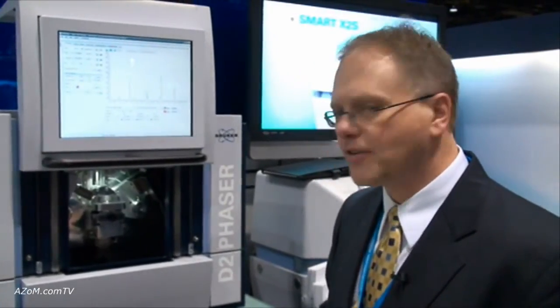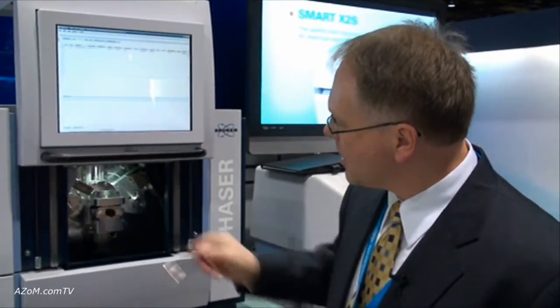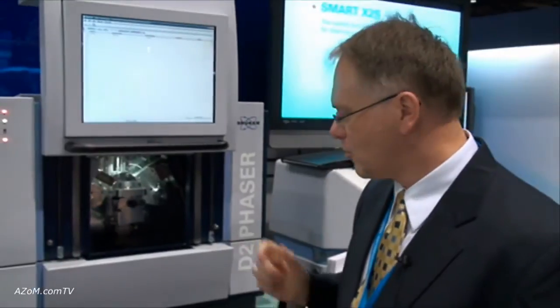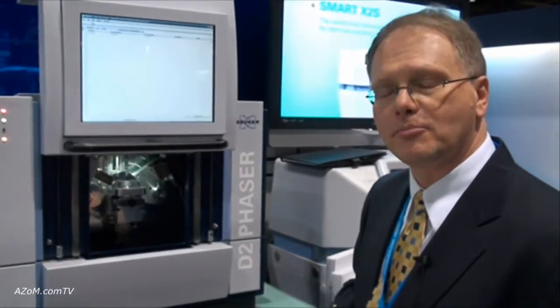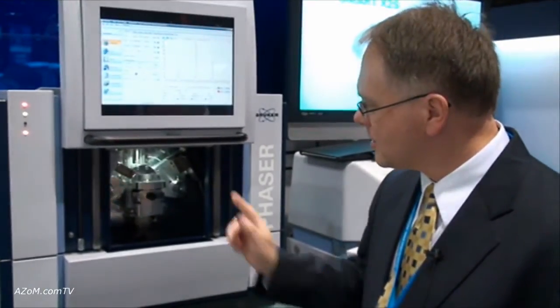Fixed mode means if you're working on a phase transition, we can capture that for you. Back to our sample changer — not only are we using our standard 51.5 millimeter sample holders, we also have a variety of standard holders used on all of our other XRD products that fit in here as well.